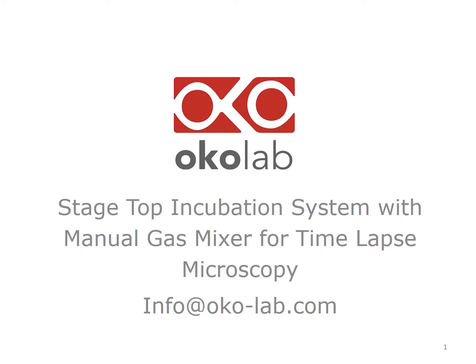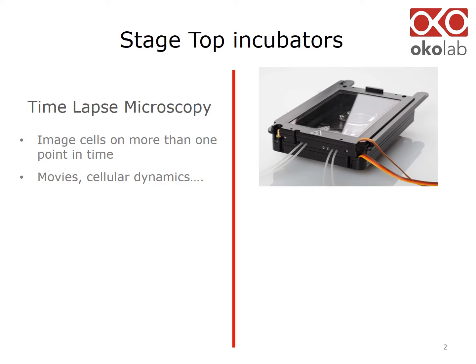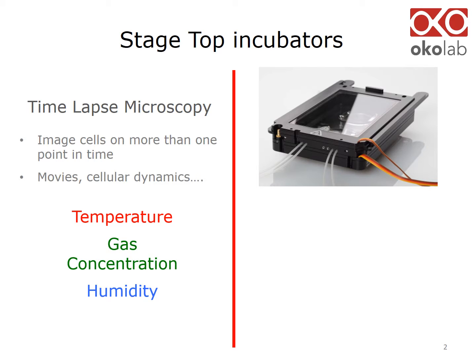Today we'll be talking about the features of stage-top incubation systems with manual gas mixer for time-lapse microscopy. Time-lapse microscopy involves imaging cells on more than one point in time. From hours to days, the challenge is how to keep your cells alive while on the microscope. You have to control temperature, gas concentration, and humidity.